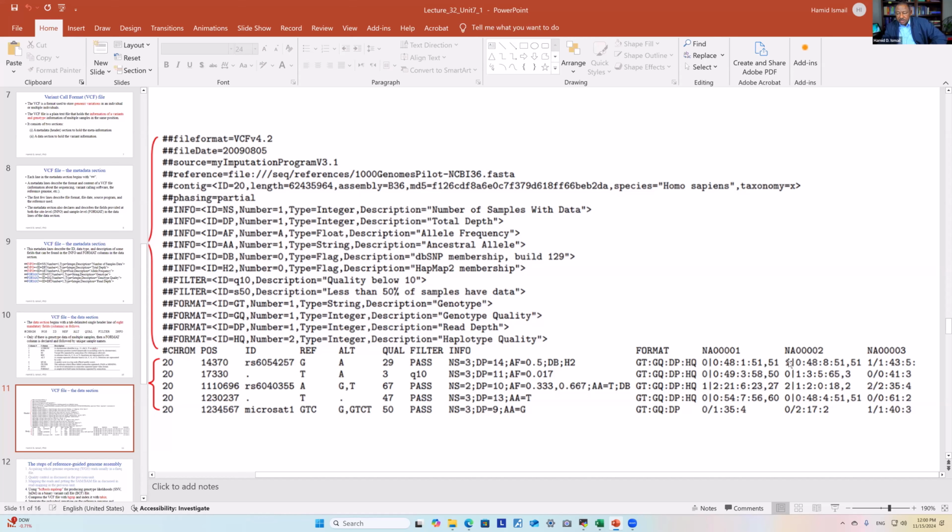Here, one allele is different from the reference genome and one is like the reference genome. This other one is homozygous, but there is a mutation in both of the alleles. All of them actually convert into A, but still it is homozygous.